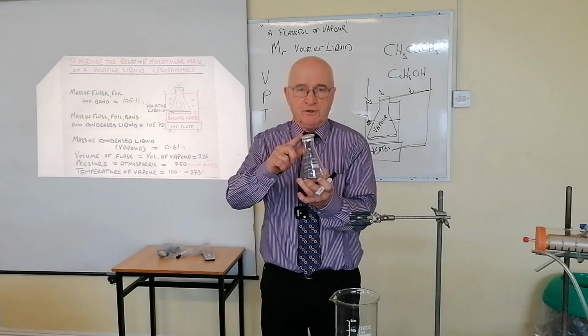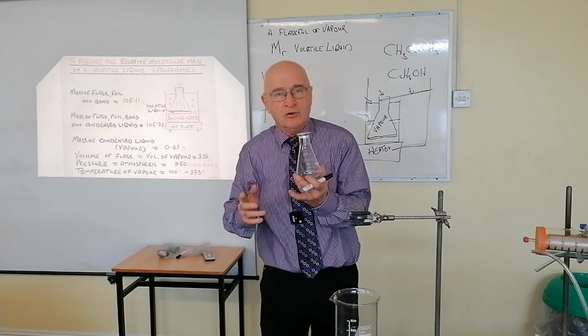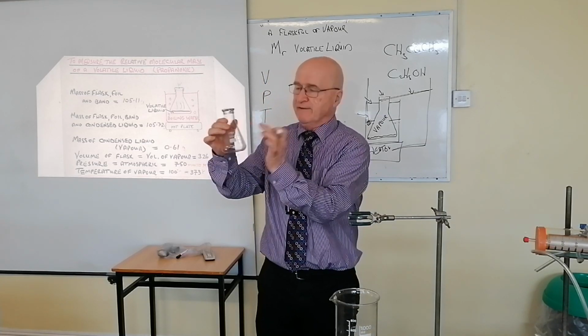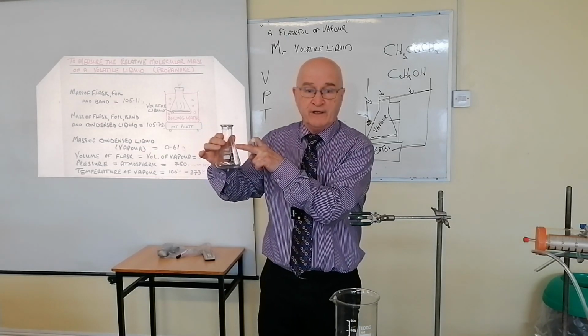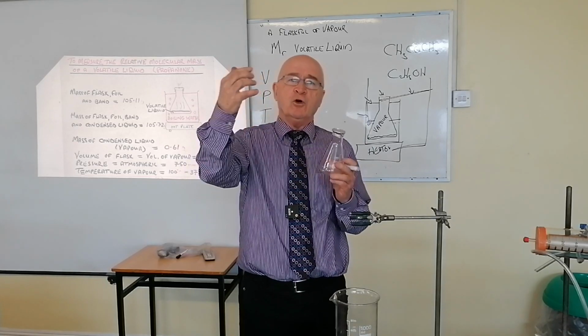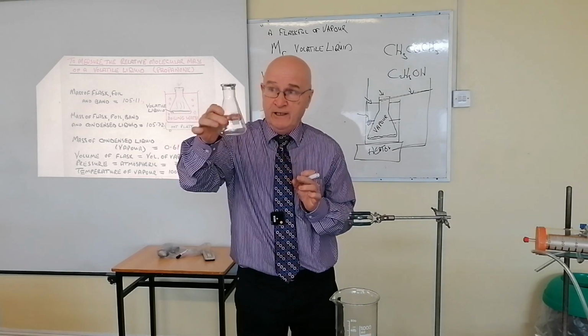Fill it with water, and please say, fill it to overflowing. Fill it until it's full. We don't say, this is a 250 flask, 250 is here, and we consider that full. If you bought a commercial product in a bottle of Coke, it's not full as in overflowing. You must fill it to overflowing.